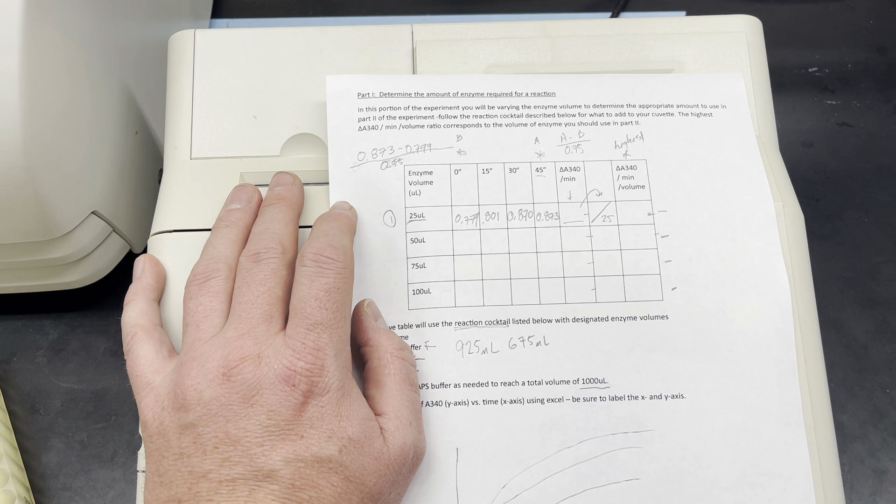Apologies if I was a little bit off there. 0.801. Keep in mind, as soon as this value pops up, that's when my timer begins — my 15-second timer. I'm reading at 0, 15, 30, and 45 seconds. Another 2 to 3 seconds and I read 0.870. And after another few seconds, I press read sample again — that's my last value: 0.873.